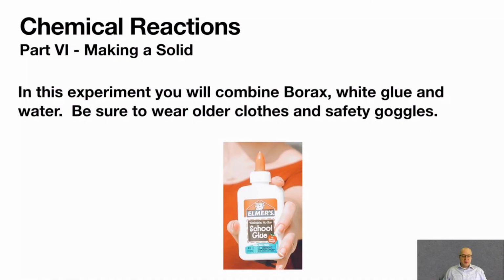And finally, in part 6 of this experiment, you're going to do an experiment called GLIME or slime, depending on who you talk to. You're going to take Elmer's glue, borax, which is sold in the laundry aisle of your Mega Mart. It's just a laundry conditioner, very cheap. Don't buy a very big box unless you use it for your own laundry. Just buy a small box, as small as you can get, and try this experiment. This is really kind of fun.